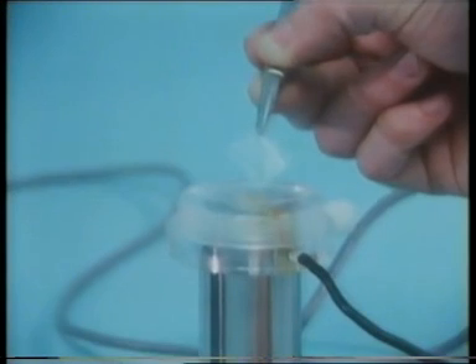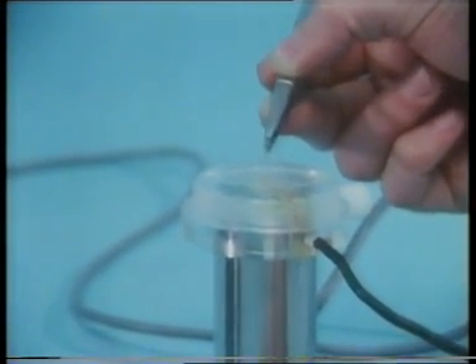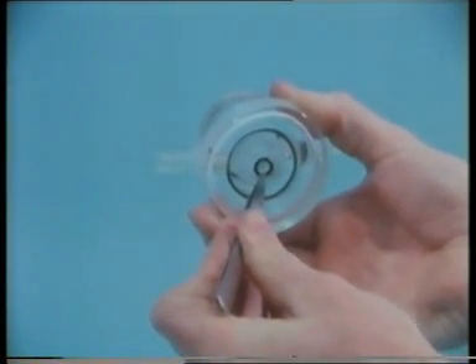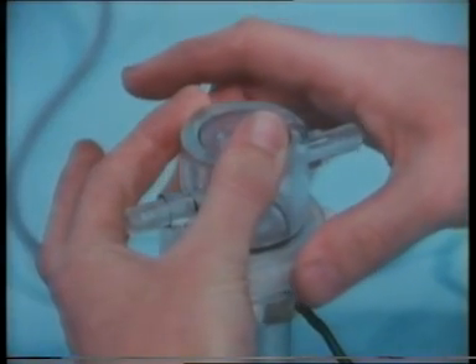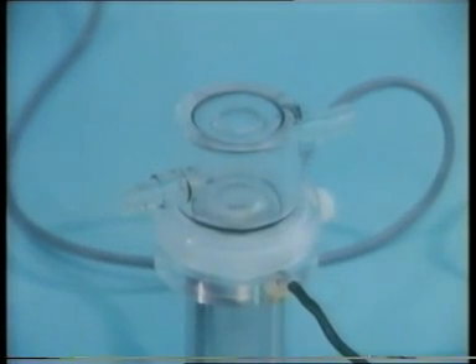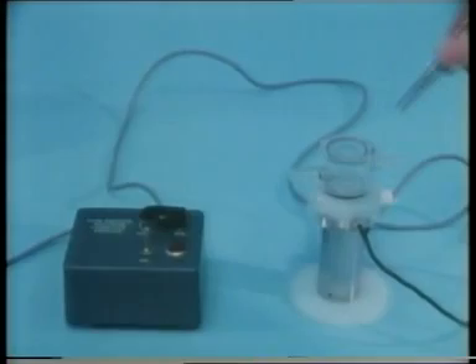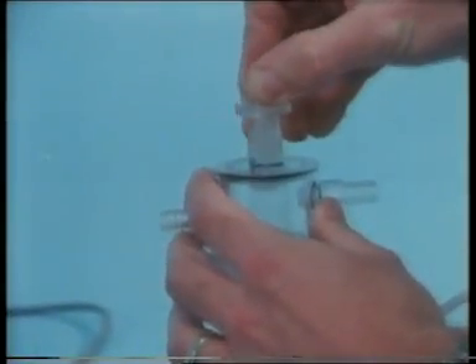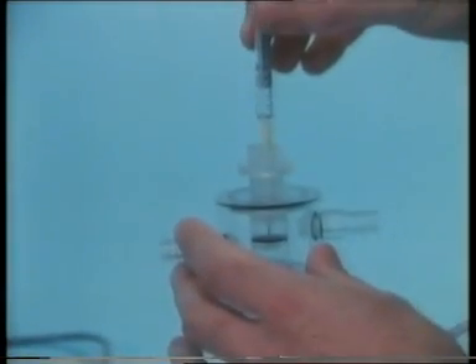Now a thin piece of Teflon is laid on top. This is the reaction vessel. It can be kept at a constant temperature by means of this water jacket. Underneath, there's a rubber ring which fits over the electrode assembly. We shall be measuring changes in dissolved oxygen concentration caused by metabolic activity taking place in the reaction vessel. The bar of the magnetic stirrer is next dropped in, and there's a plastic stopper. Different solutions can be added to the mixture in the reaction vessel by means of a syringe inserted through a hole in the stopper.